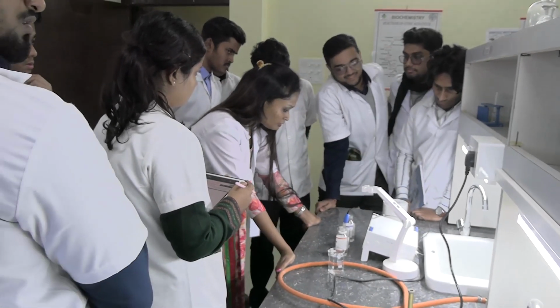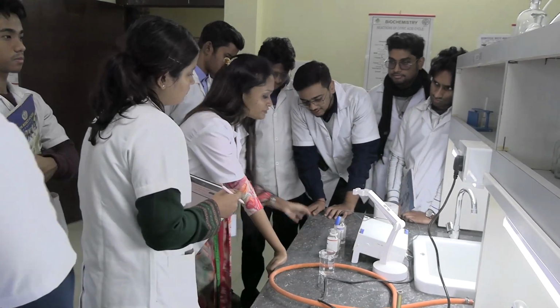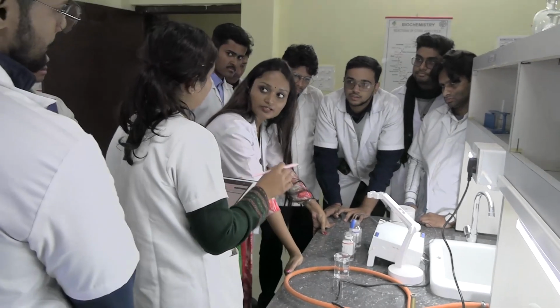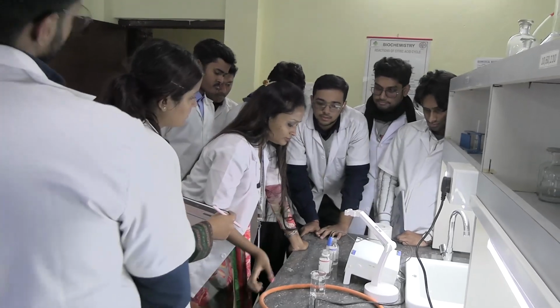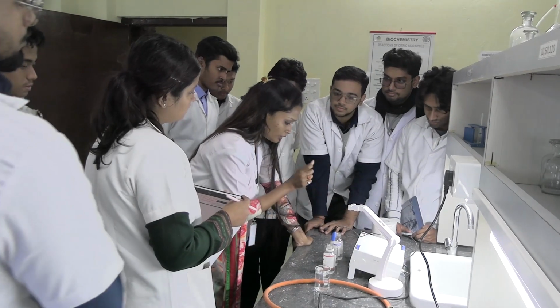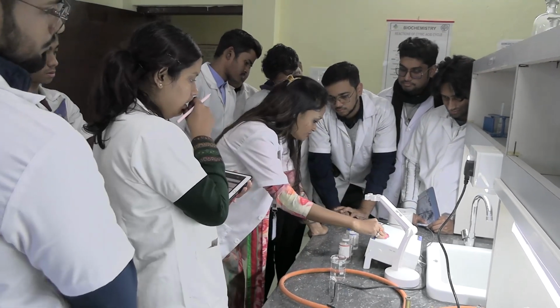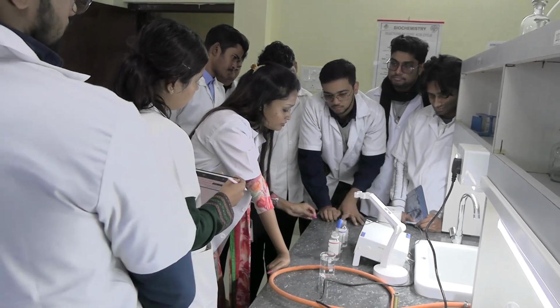So why have we set the meter with pH 7 and pH 4? What is the use of them? 7 is neutral, 4 is acidic. Why do we have to set with buffer? In bigger labs they have a pH meter covering all of pH 0 to 14, but this is a smaller instrument, so they have provided pH 7 and pH 4.